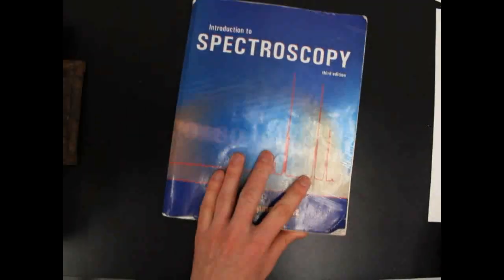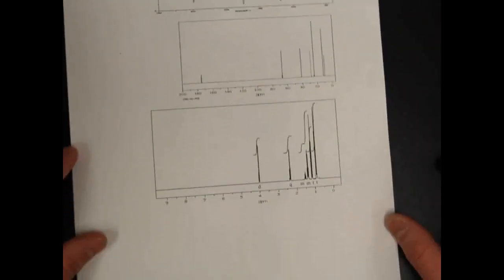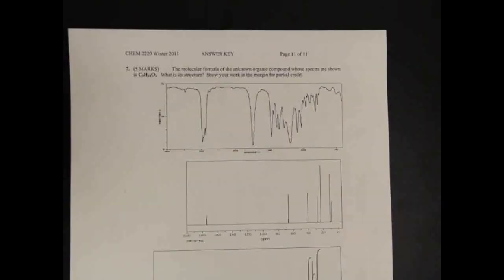The key is to develop a decent algorithm that breaks down the spectra into bite-sized chunks, which are easier to manage. The one I'll be showing now evolved over about 2 months and worked well until graduate school.